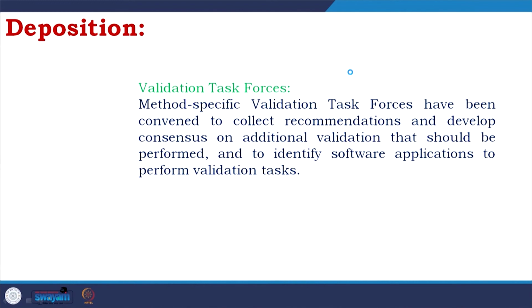Validation task forces: method specific validation task forces have been convened to collect recommendations and develop consensus on additional validation that should be performed and to identify software applications to perform validation tasks. I do not want to go into detail, but this is an area which is very critical. If you imagine when the first crystal structure, myoglobin, was solved, people never imagined that at least thousands of structures would have to be deposited, but now that is the case. So, there are validation task forces before you put it into the format.